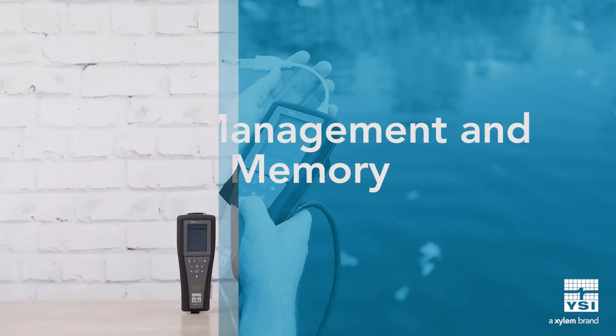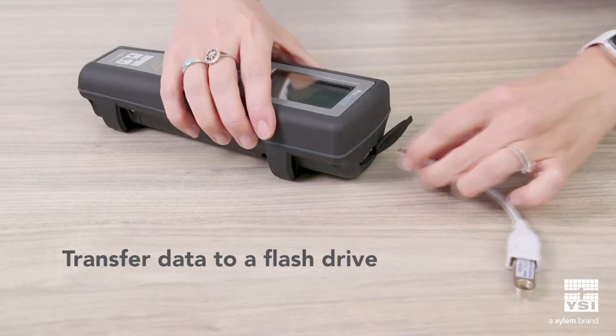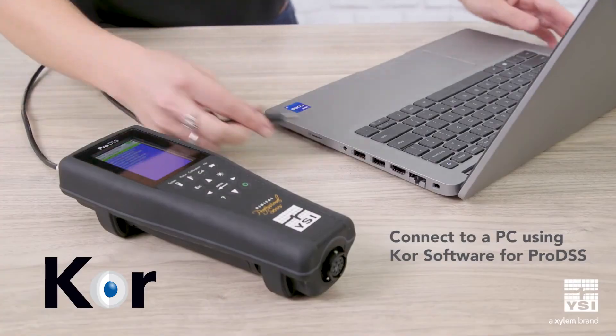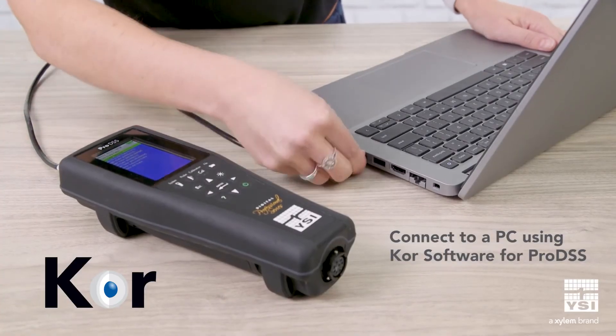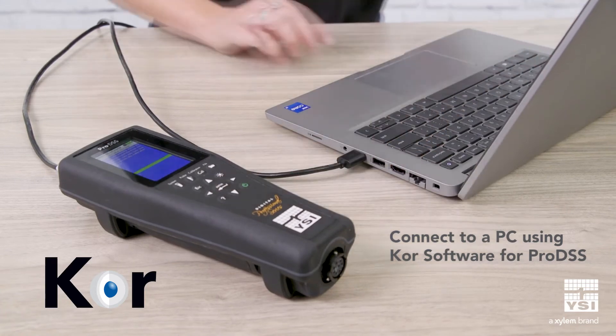Both instruments feature a large internal memory and an on-the-go USB port for transferring data to a flash drive. Pro DSS offers 20 times more internal memory than Pro Quattro, and allows direct connection to a PC using YSI's EcoWatch software. This makes it easy to view recorded data, calibrate sensors, and ensure equipment is operating at peak performance.